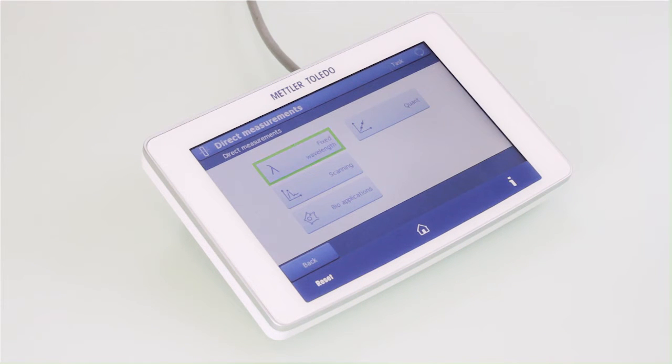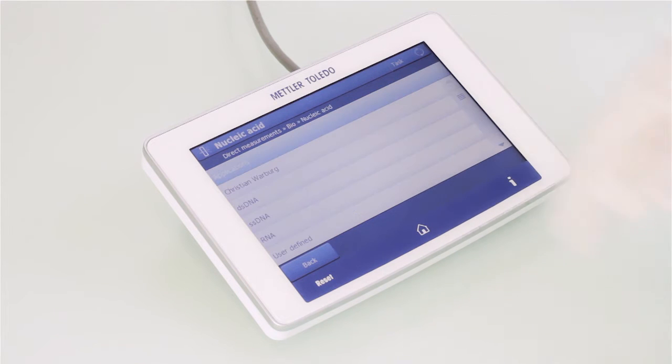You can select fixed wavelength, scanning, quantification, or predefined bio applications. For a DNA concentration measurement, choose nucleic acid and then double-stranded DNA.